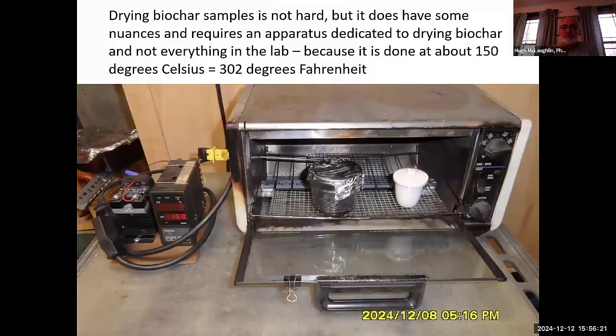Here is the next step. We want to take the water out, and the water in biochar can be anywhere from almost minimal, not quite bone dry because it absorbs from the air, but it can be up to 3 and 4 times the weight of char because it has so much voidage. And herein is the apparatus that was used for many, many years by me to dry the material out. And we need to be essentially what is called bone dry, and that means we've taken away the absorbed water also, and that's done at 150 degrees C, not 104, like the drying oven in every lab.